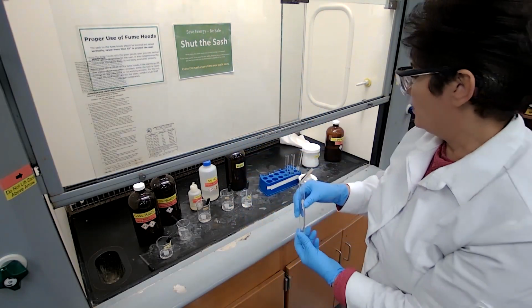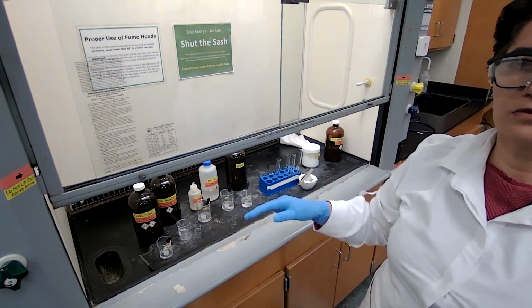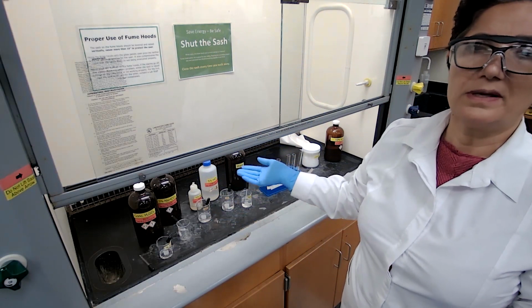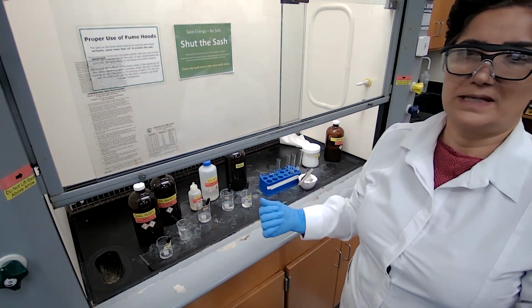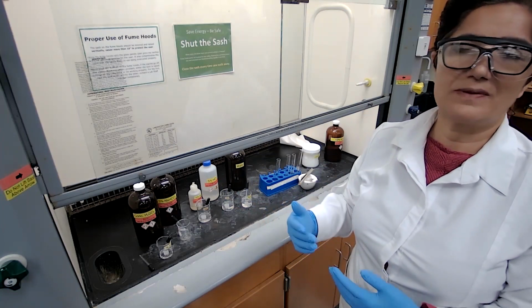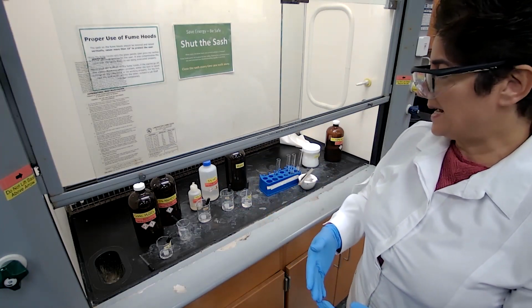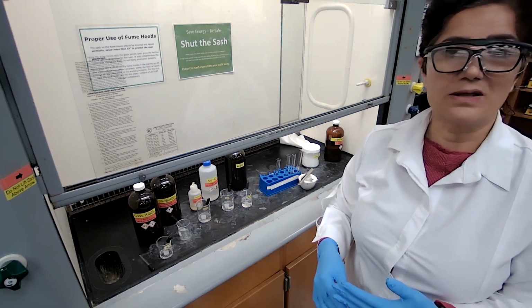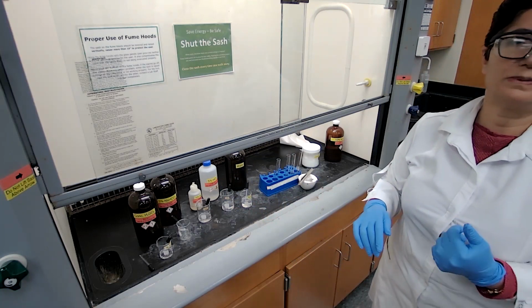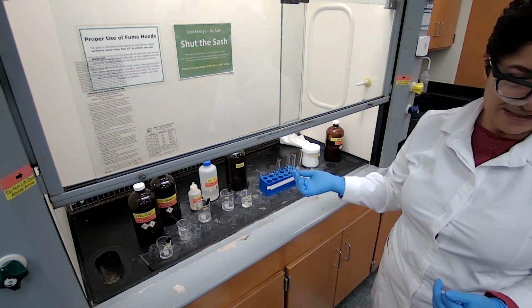What does it mean if the sample is soluble in sulfuric acid and not soluble in sodium hydroxide or water? It means that the compound is polar, but it has a high molecular weight. Out of the choices that we had, carboxylic acid, alcohol, ketone, and aldehyde, this compound could be an alcohol, a ketone, or an aldehyde. Definitely it is not a carboxylic acid.